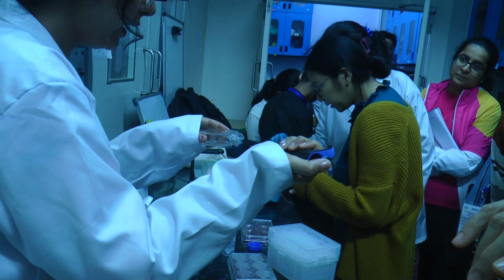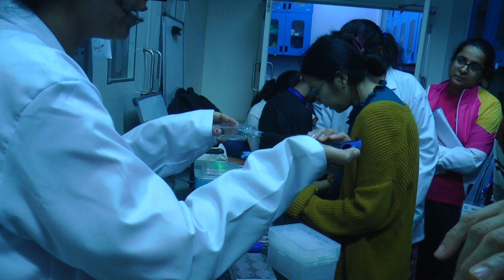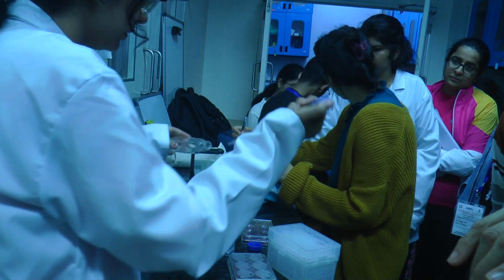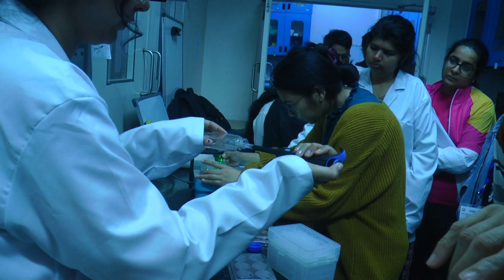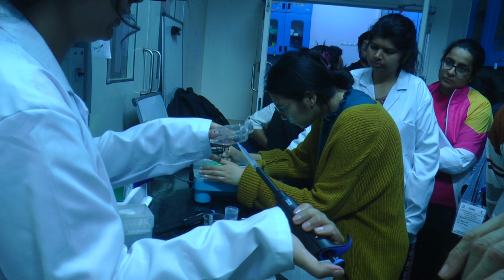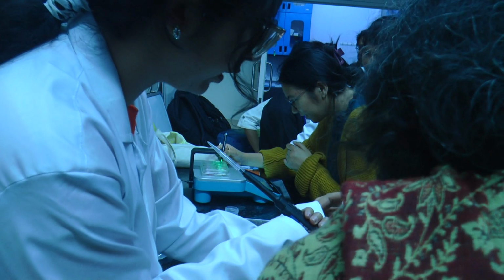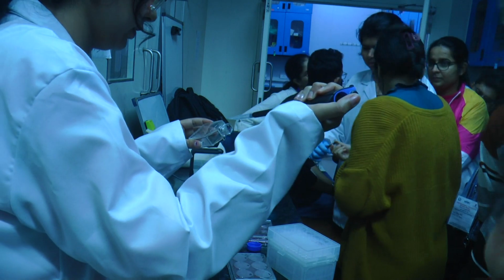So we have to add it slowly so that the cells should not come out. We should not add it with pressure, very slowly. This is a little bigger flask, so I'll wash it with 2 ml of this vesiculation buffer. Slowly, and then I'll move it gently. Just this much is enough, and then I'll remove it. Now we can see this is turbid. There are some dead cells or cells which are not adhered.